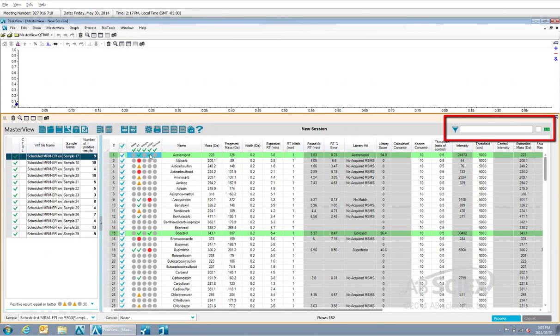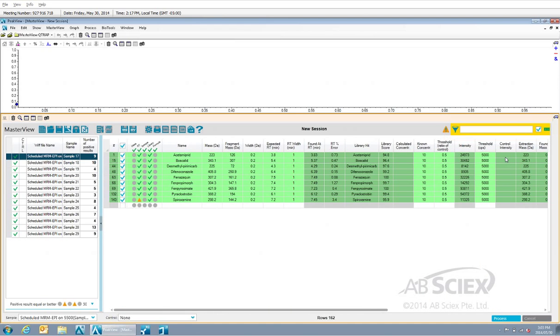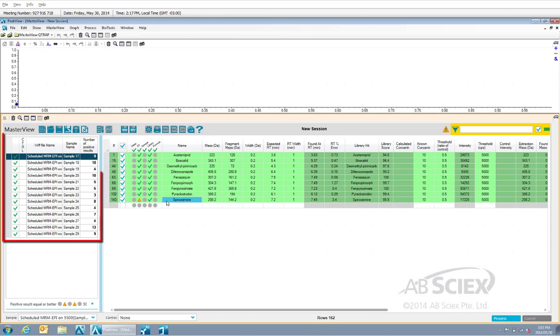By clicking on the filter button in the middle right side of the interface, our table is reduced to only show the compounds that matched our data processing scores for retention time and MS-MS library hit. You are also able to quickly see the number of positive results in each sample in the table on the left side of the screen.